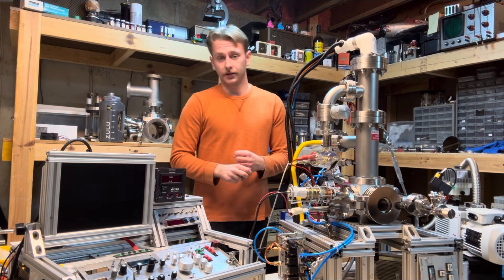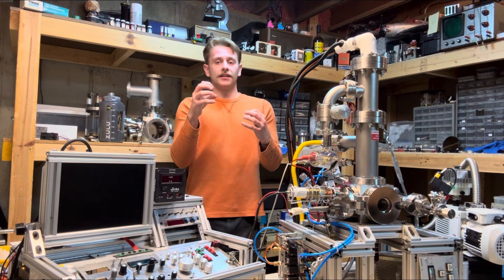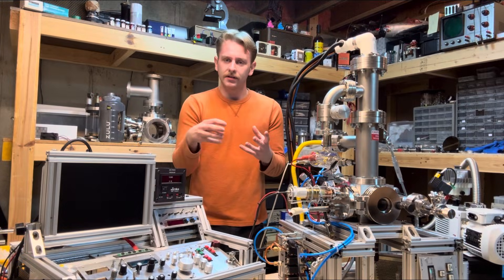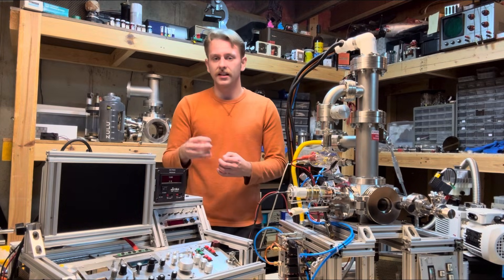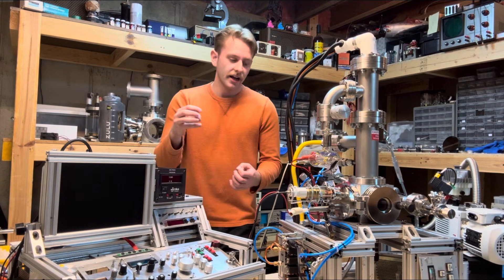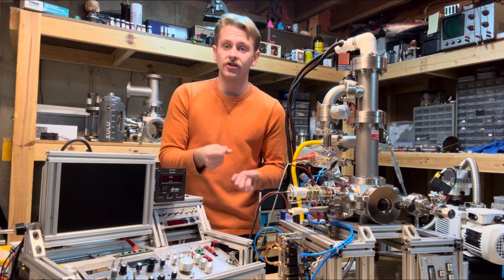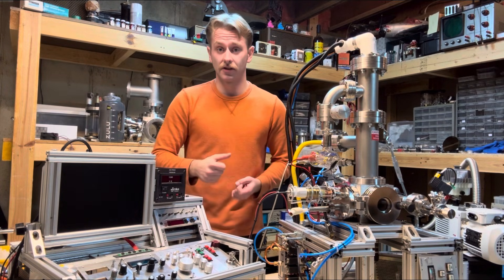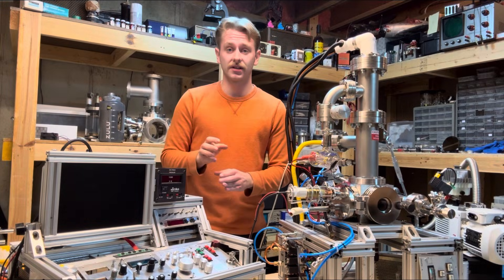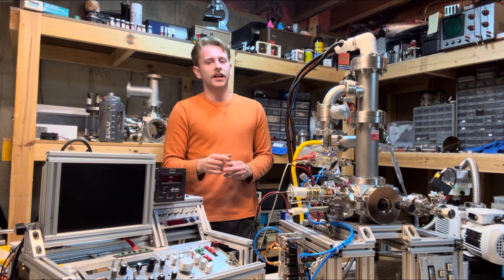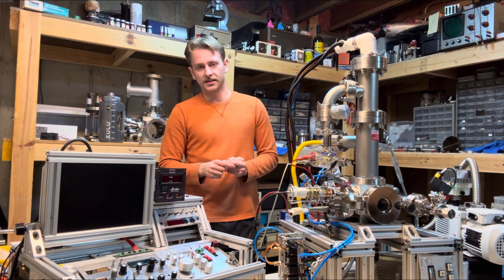And I collect them with this little cage that's got a voltage on it. And this whole detector system, I've got it right here. It's called an Everhart-Thornley detector. There's a high voltage, but relatively low compared to the rest of this thing. It's like 300 volts on this cage. And so it's not going to have enough energy there to attract the highest energy electrons that are getting scattered off. Because those are X-rays, and they don't mean nothing to us.